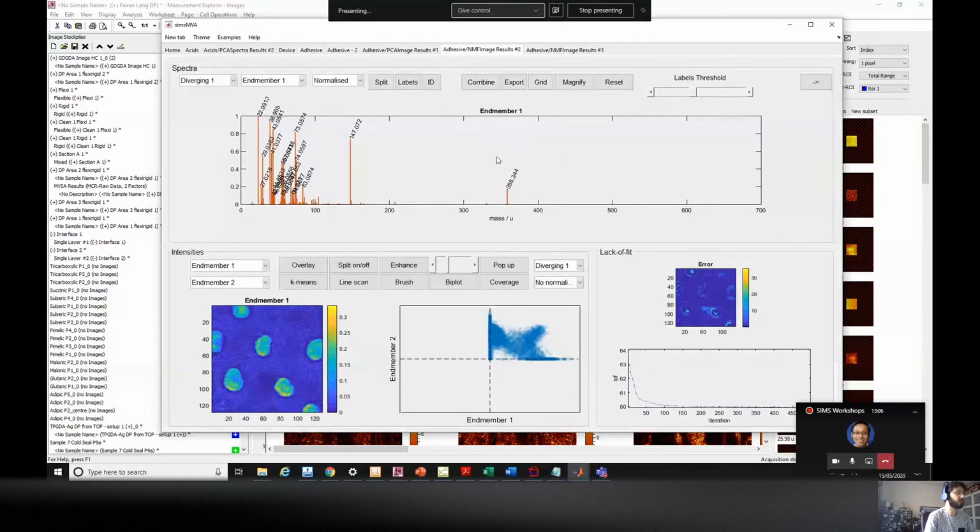Right, so you go there, it's like we always have the top panel showing here the intensities of the end members. So we covered this already. So there's no negative values now. So each end member will look like a characteristic spectrum from a compound, let's say. And here you have that same window that we were using to explore this course.